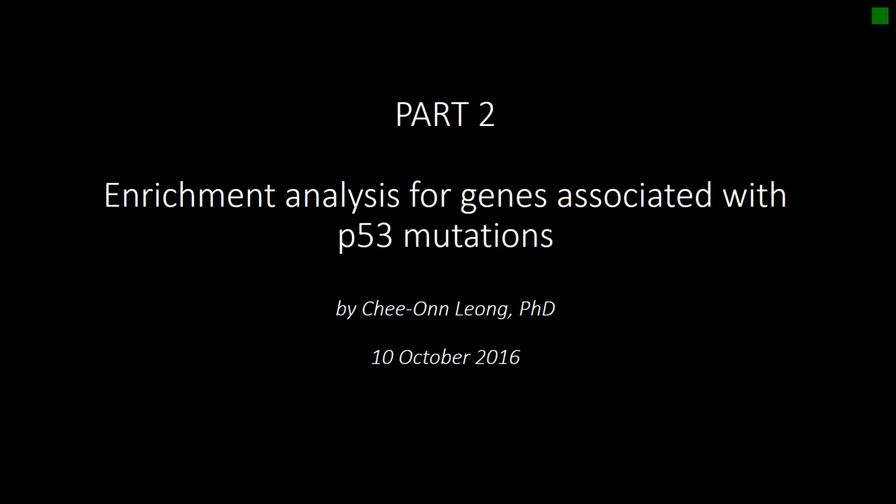Okay, good morning. Welcome to the second part of the analysis. In this exercise, we are going to do enrichment analysis for genes that are associated with different types of p53 mutations, including the R273, R175, and also the nonsense mutation.